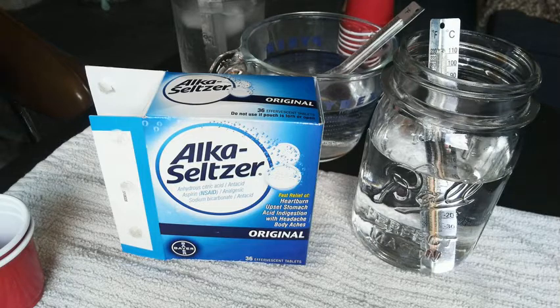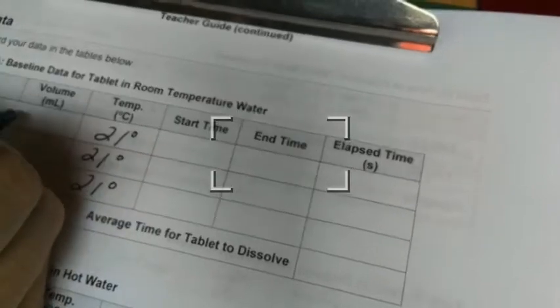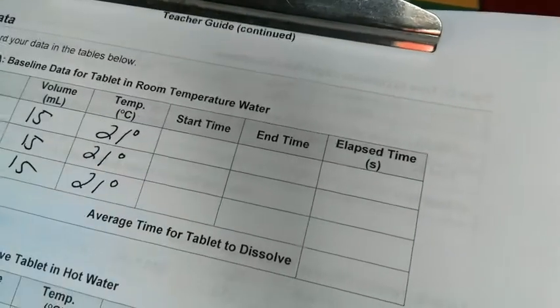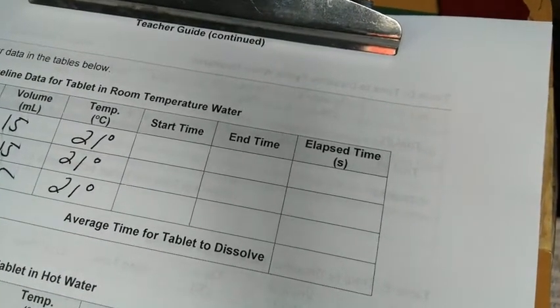So the number of milliliters here is going to be about 15 milliliters. So we're just going to do that for every single one of these. So we'll just do 15 milliliters here, so make sure we keep the volume the same. Okay? We're going to do that for all 3 trials.